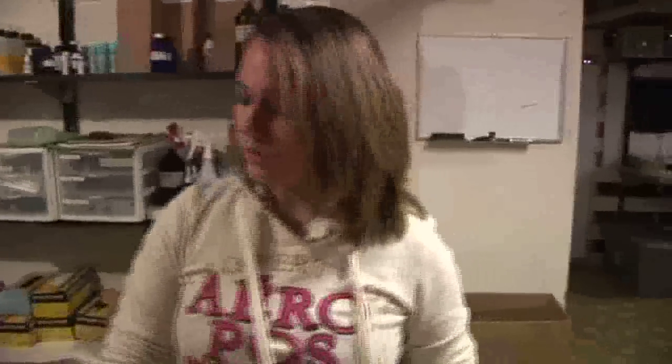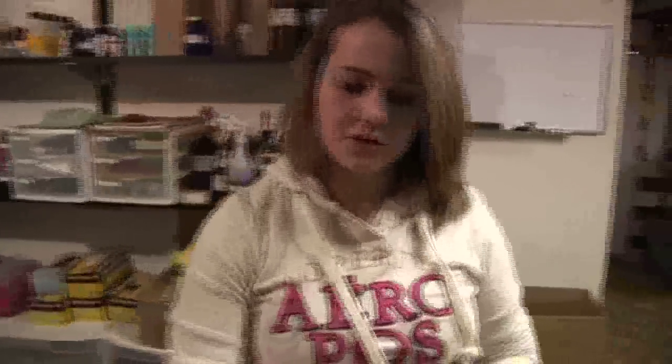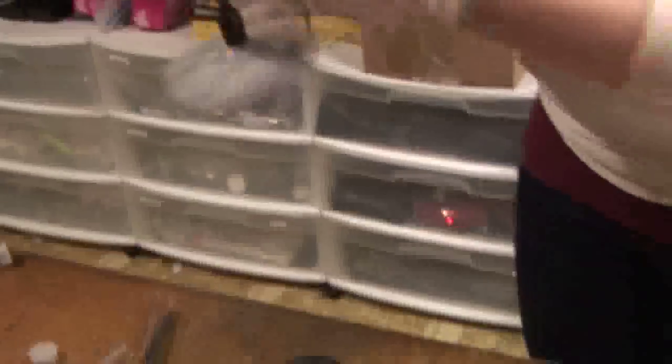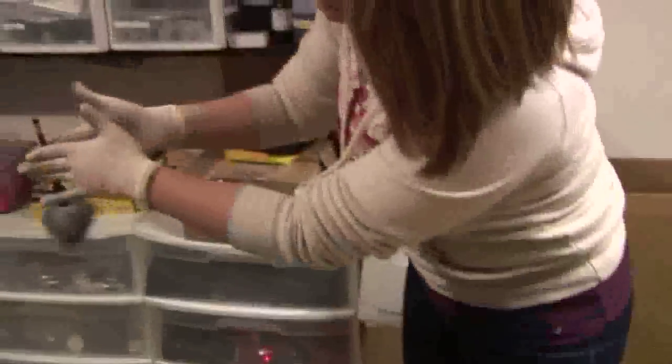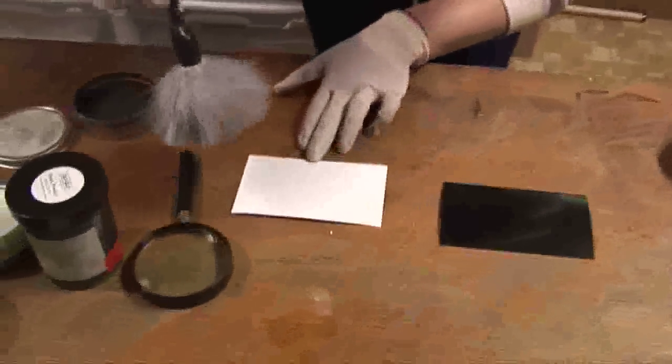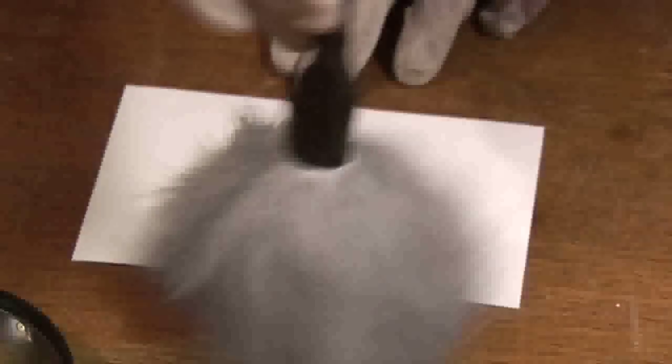Now we have a special powder called Duel. Duel is a powder that will work well on both light and dark backgrounds. On a light background it'll look black, and on a dark background it'll come up silver. Here on the light background it looks a lot like just regular black powder, and here on the black background it looks almost shimmery silver.